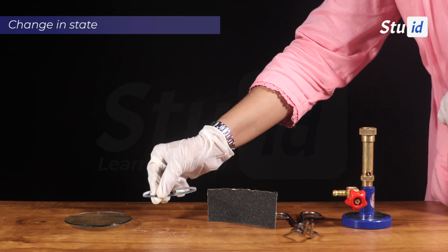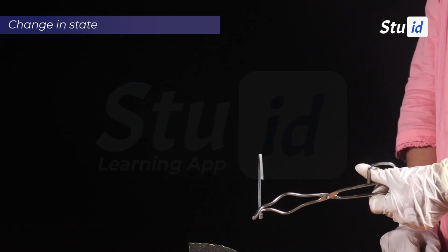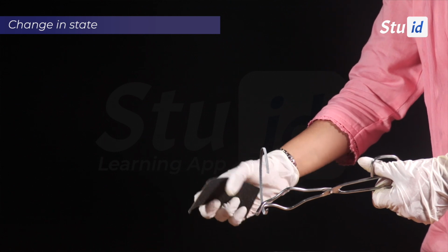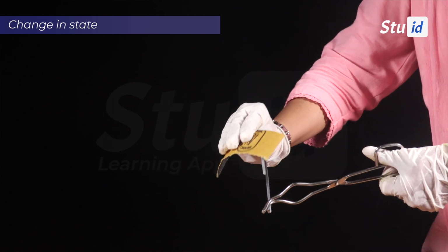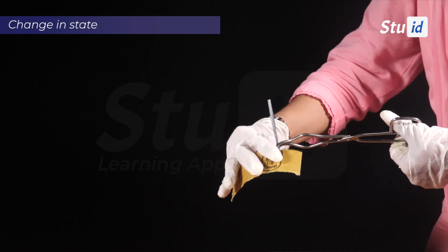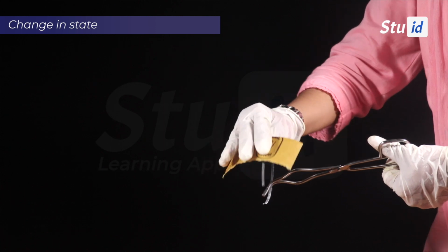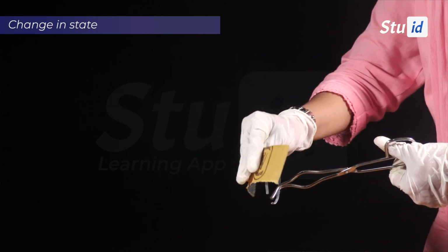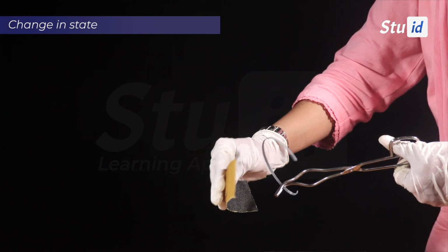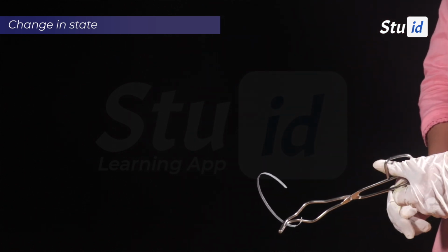For that, we need a piece of magnesium ribbon and a burner, also a watch glass. Now, we have to always rub magnesium ribbon. You know why? Because it's an alkaline earth metal, and hence it's always reactive. If we rub it with sandpaper, the impurities on top of magnesium can be removed and it can be burnt effectively once exposed to a flame.